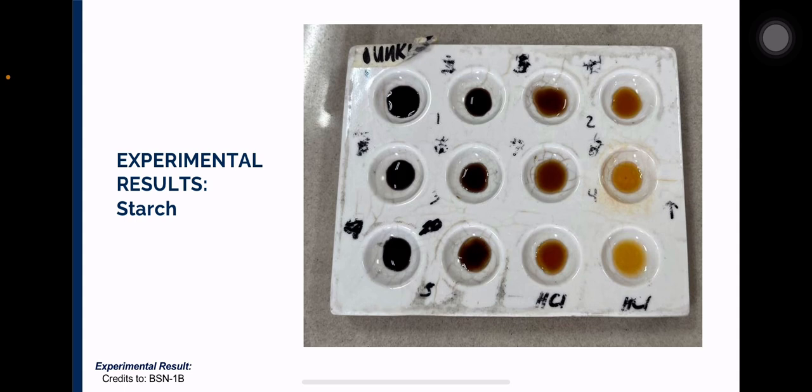This summarizes the expected results. Starch digestion progresses from blue-black to brown to yellow. Glycogen digestion shows a reddish-brown color that changes minimally with time. Remember that Lugol's iodine is light sensitive, so it must be stored in dark containers.